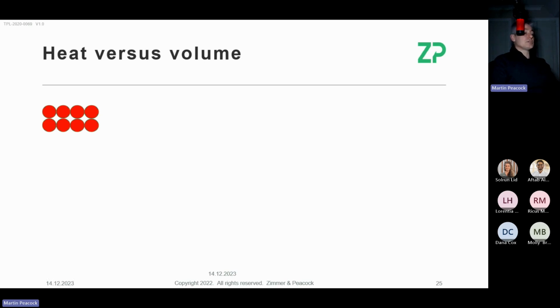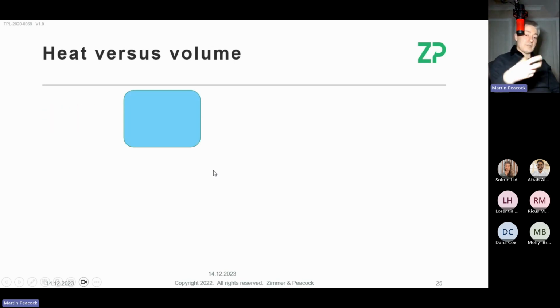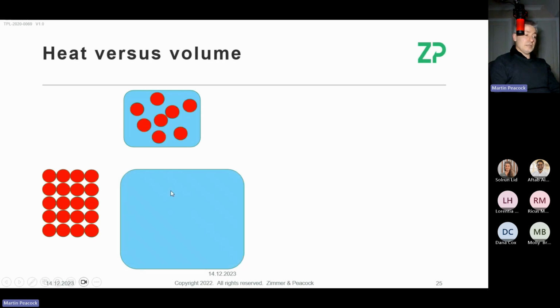The reason I bring it up is that if we're doing a mild chili sauce, such as Tabasco, it's only 5,000 Scoville heat units, which means we only use a small amount of volume to test it. If Tabasco is around 5,000, a 1 in 10 dilution gets us to 500 Scoville heat units. If we're doing something hotter, say 50,000, we'll do a 1 in 100 dilution, because 50,000 divided by 100 gives us 500.